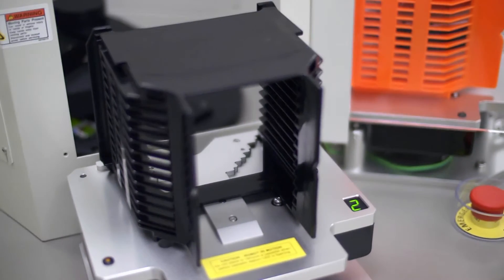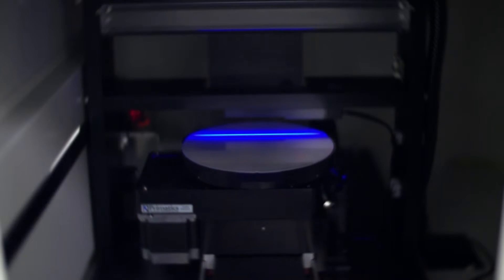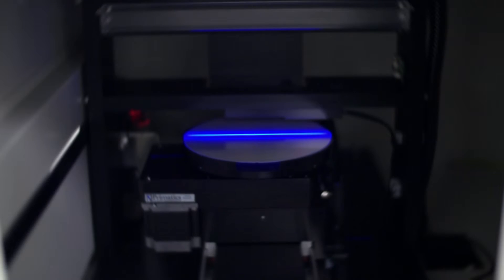Imperia also provides critical reactor health feedback directly after process on 100% of wafers, significantly saving time and money for the end user.